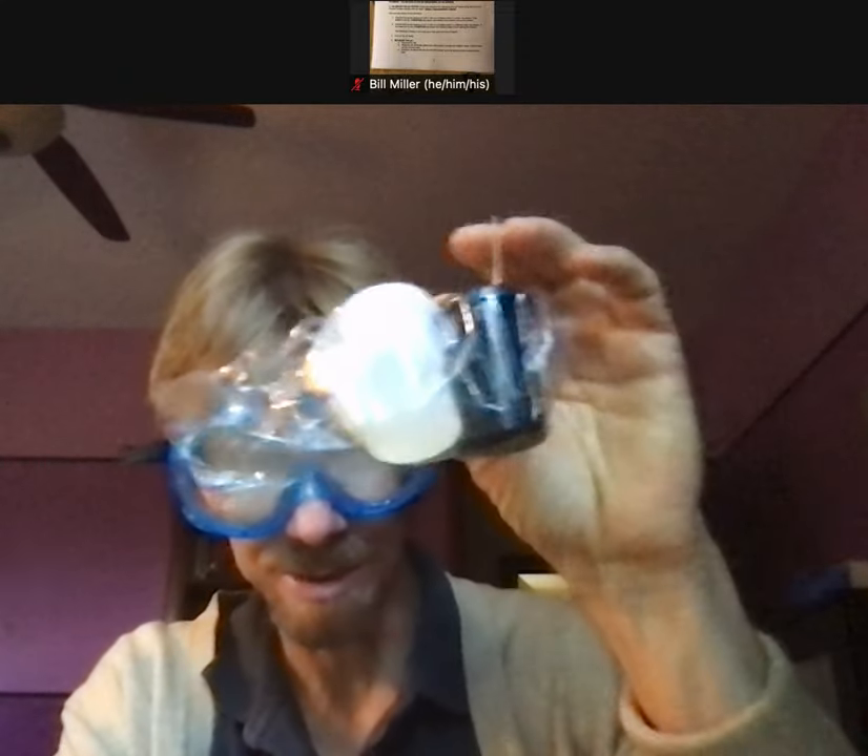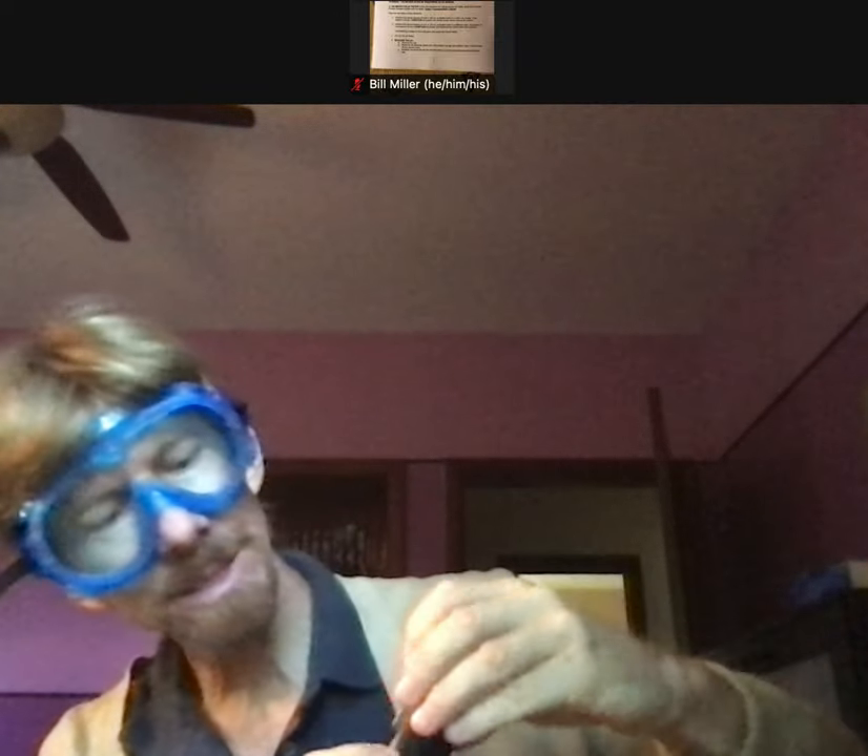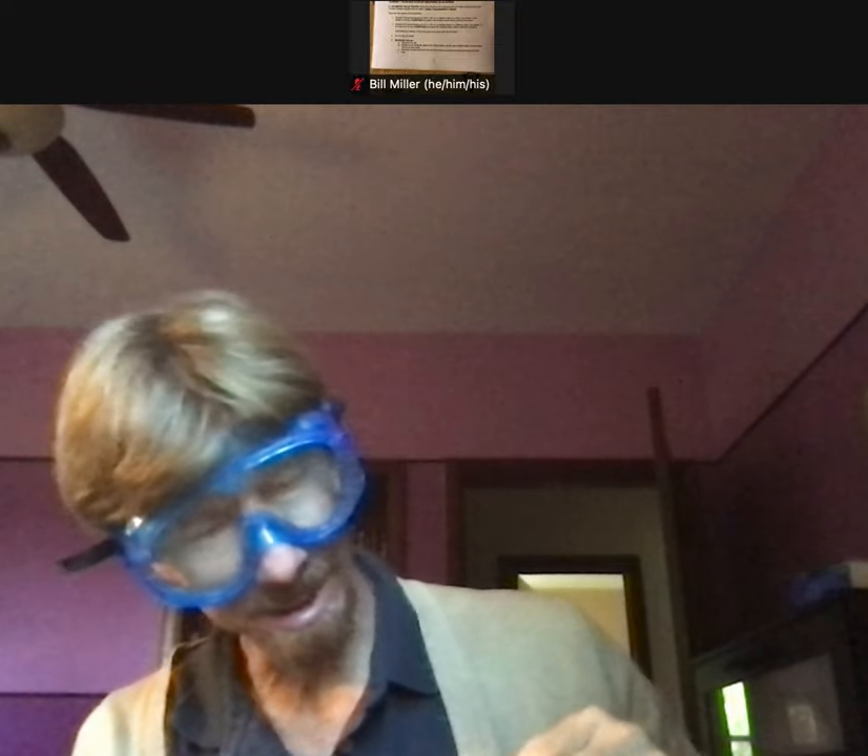Hi. This is a video for the titration lab in which we calibrate the pH tester. I've got my pH tester here and the lab kits come with a little baggie. If you look inside that baggie there should be two containers — one of which says pH 4 and the other which says pH 7.